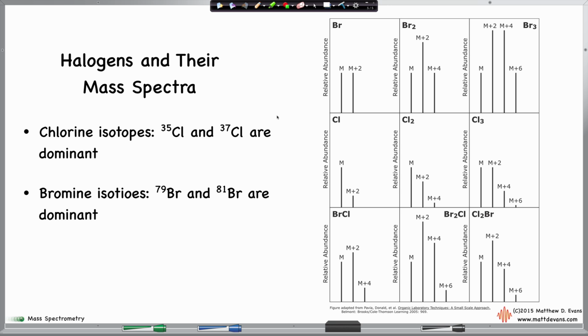And they're really easy to spot because if your molecule, your unknown, contains bromine, what you're always going to see is the parent peak has 2 equally heighted, I don't know if that's a word, but I just made it up, 2 equally heighted peaks that are spaced 2 atomic mass units apart. So let me just sketch out here for a second the 2 common isotopes of bromine. One isotope that's fairly common, about 50%, is bromine 79. The other one that's common is bromine 81. That's about 50% as well.